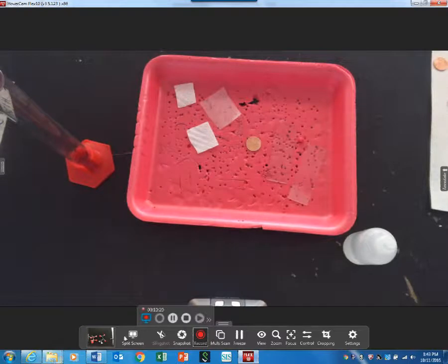All right. Let's talk about how we're going to do the lab. Some are going to do the first parts at your seat while some do the acid bases. Then we're going to switch.